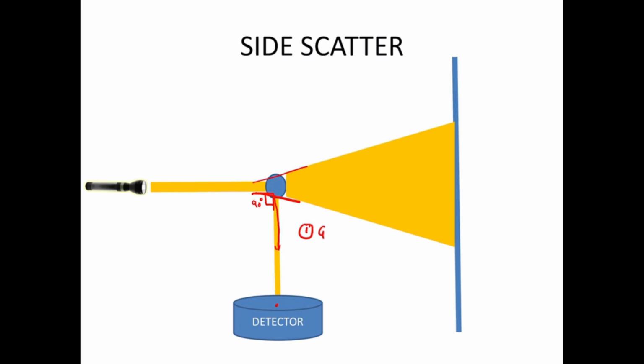First is the granules. The cells which are going to have a higher number of granules are going to have higher side scatter, because these granules act like a mirror, and the cells which have a higher number of granules will have higher side scatter.